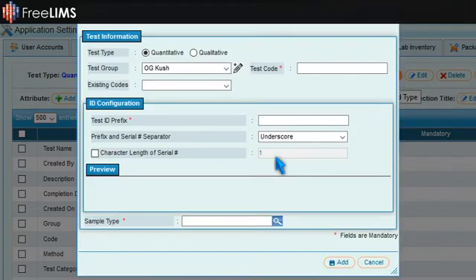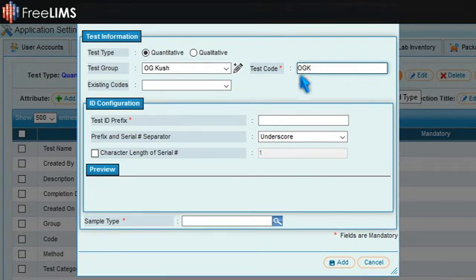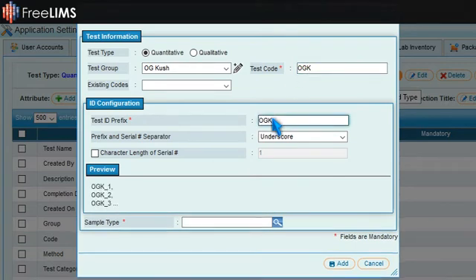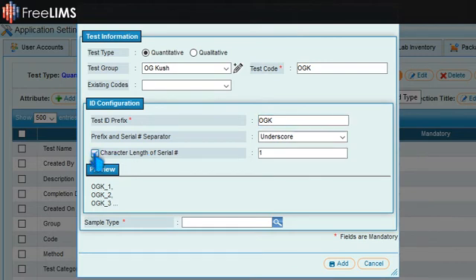Specify a unique test code and a test ID prefix. To define the character length of the serial number, tick the box corresponding to character length of serial number and specify any number between 1 and 9.